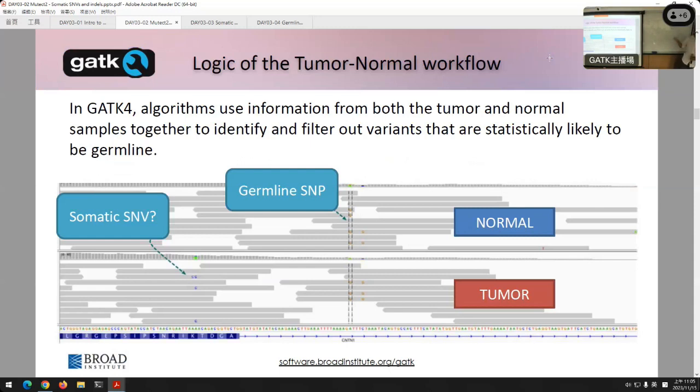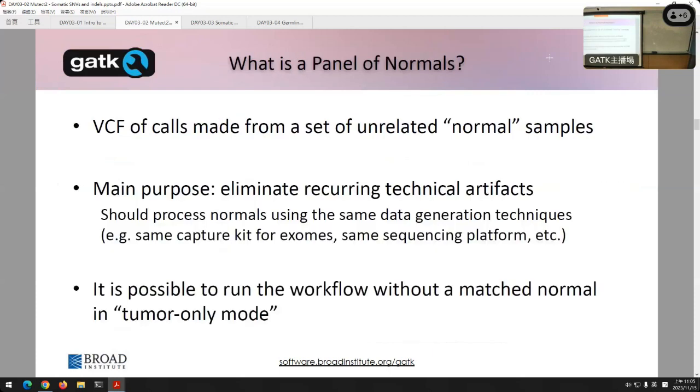So we're actually feeding in and analyzing the raw BAMs from both. It's not a simple subtraction. We're combining various sources of information to get more statistical confidence in our calls. It's a little harder than just saying, hey, I see these calls in my normal sample, I'll sequence them separately and subtract them off. We've got to do a little more than that, and I'll go into a little more detail about that for you.